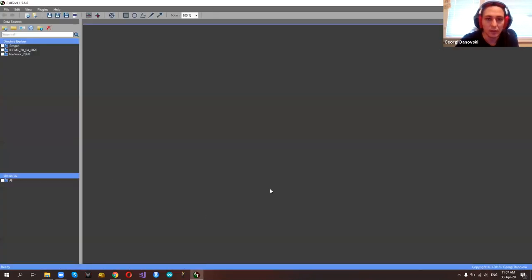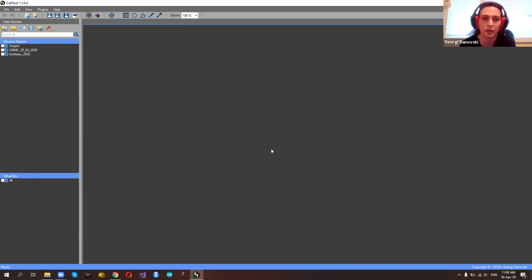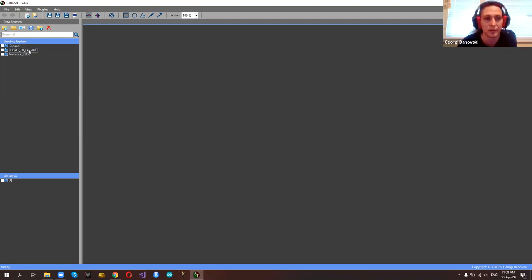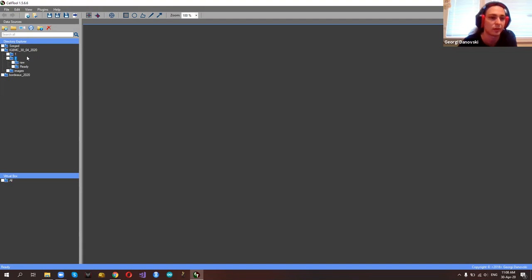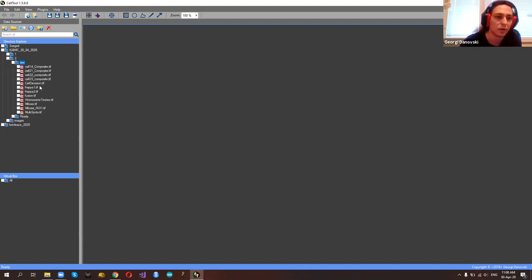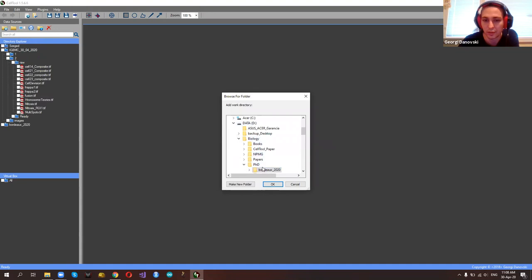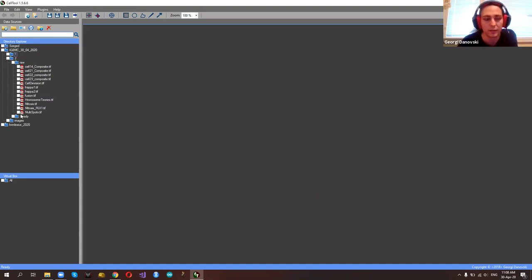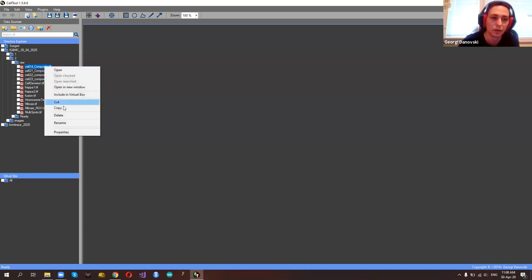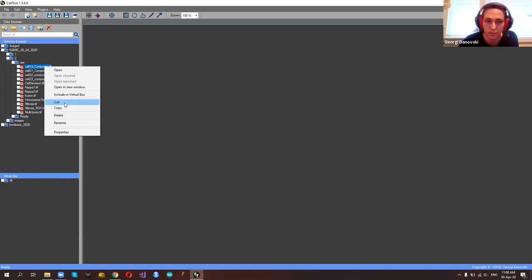This is the main user interface of our software. It is a single window interface divided into panels. On the left you can see a file explorer, similar to what you are familiar with in Windows and other operating systems. From here you can browse for your files, add work directories from your computer by simply browsing to the directory, pressing OK, and the directory will be added to this file browser. From here you can copy, cut, paste, delete, rename files, make directories, and everything you're familiar with.